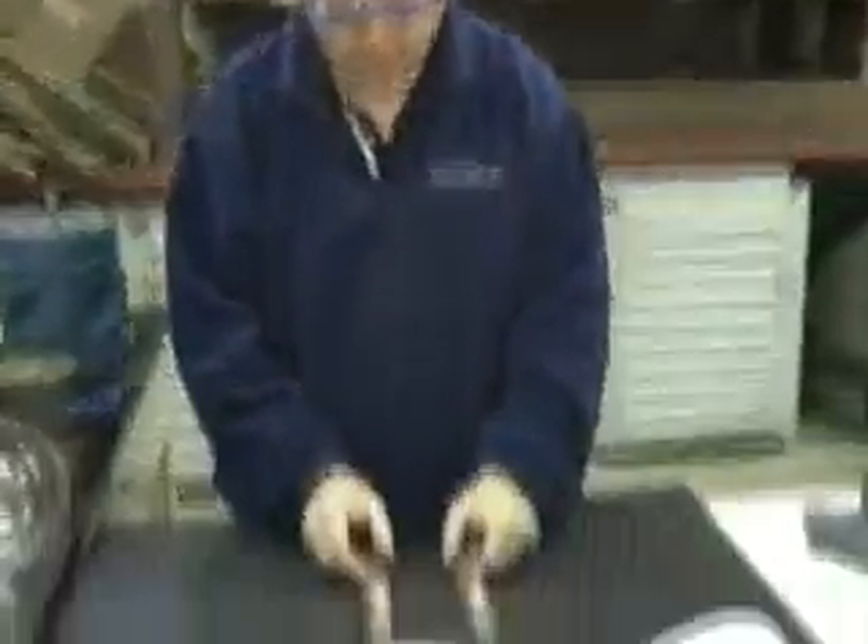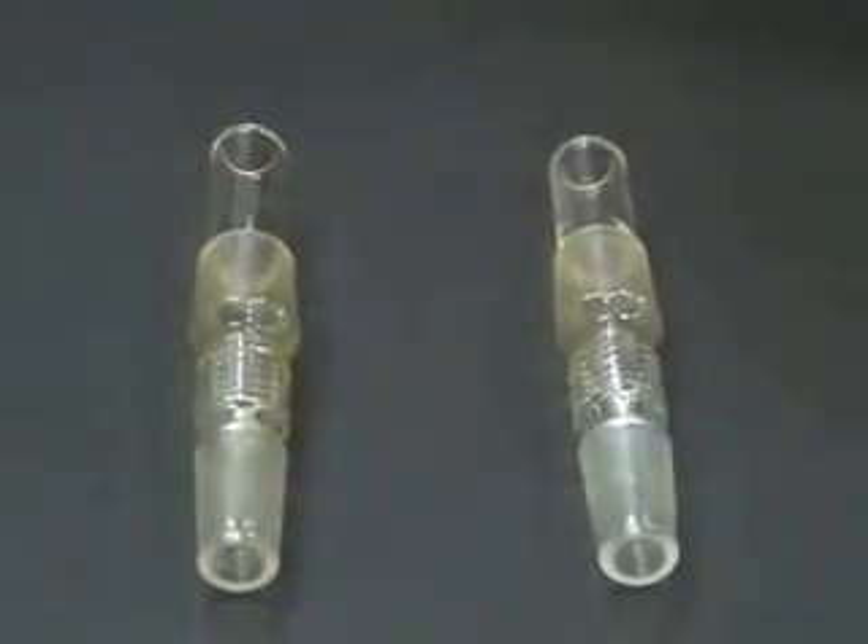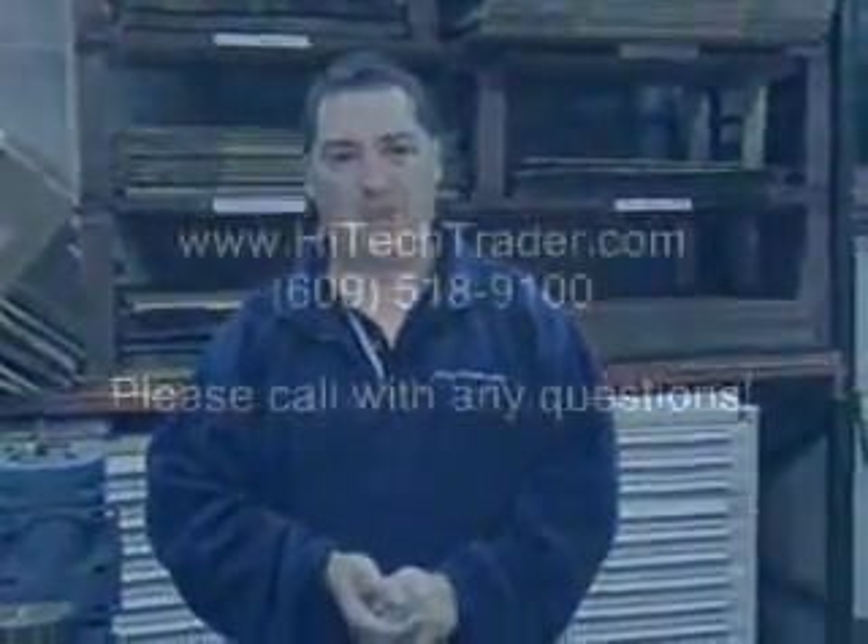Once again, so you can see, very similar glassware. Please call us — we have surplus inventory of these particular pieces at 609-518-9100. Once again, Michael Macow from Hi-Tech Trader. Thank you.